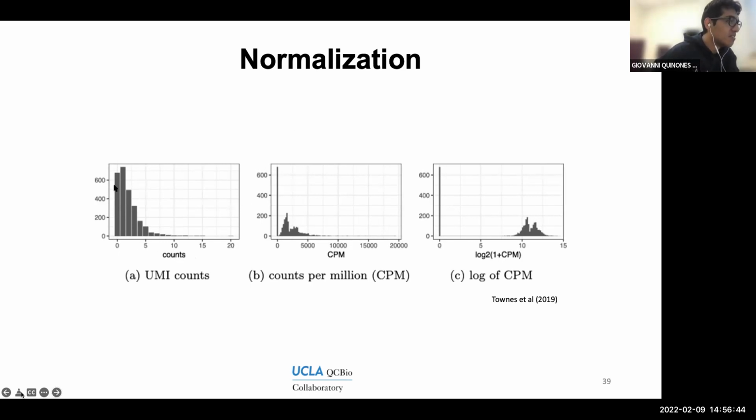And if you look at the distribution in this histogram, you can see that it's very continuous. It looks like a fairly natural distribution. And this is typically what you get. Most of the genes having a 0 count or a very low count, and then trailing off when approaching higher values.